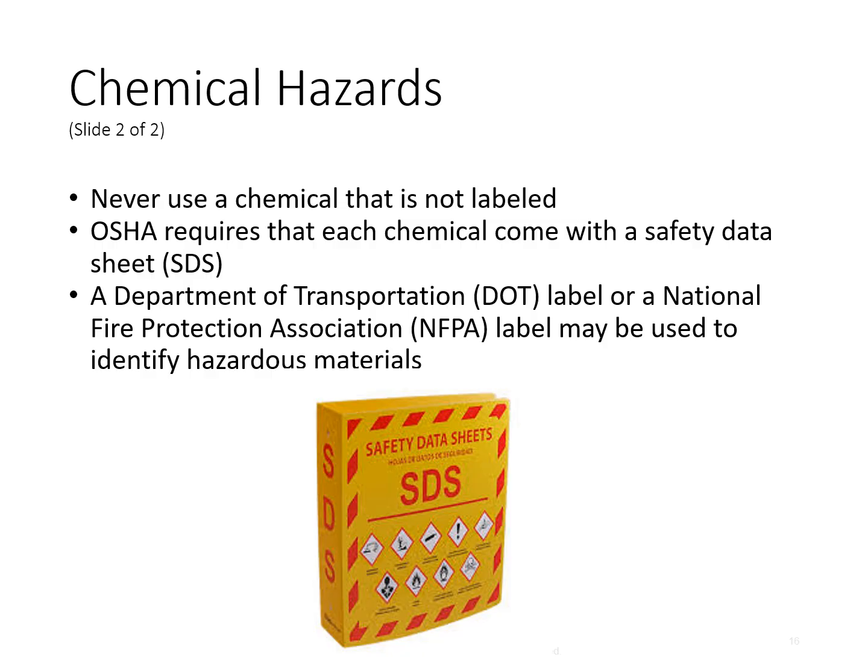Never use a chemical that is not labeled. If it's not labeled, we don't know what it is, right? And if we don't know what it is, we won't know how to properly help if you become exposed, and we won't know how to properly clean it up either. So make sure you never use anything that's not labeled.